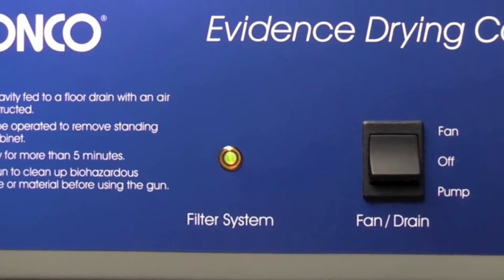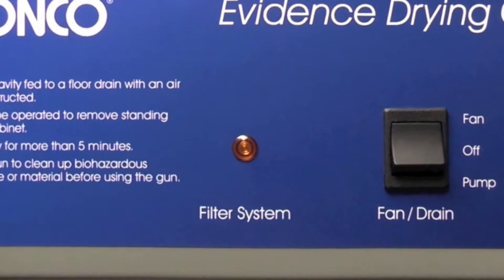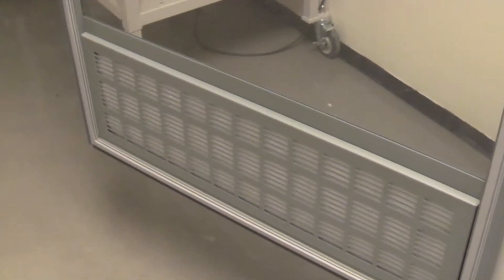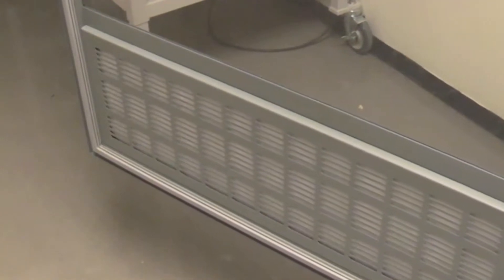The red filter system alarm light illuminates to alert the operator to low airflow conditions that may indicate a loaded pre-filter or HEPA filter.